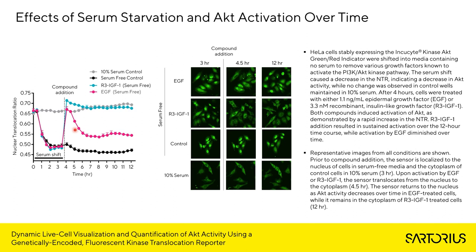After 4 hours, cells were treated with either 1.1 nanograms per mil epidermal growth factor, or EGF, or 3.3 nanomolar recombinant insulin growth factor, or R3-IGF-1. Both compounds induced activation of AKT as demonstrated by this rapid increase in the NTR seen here.